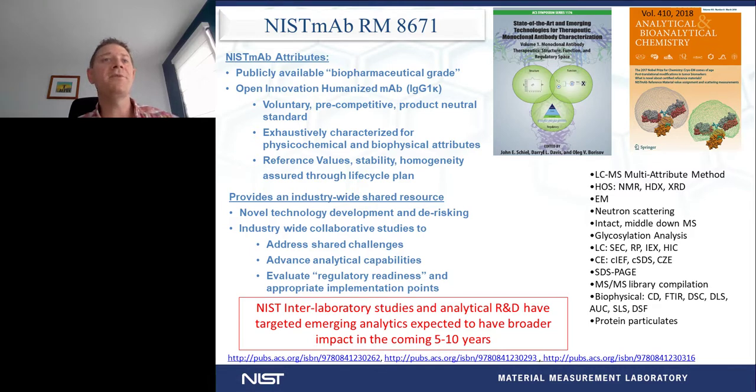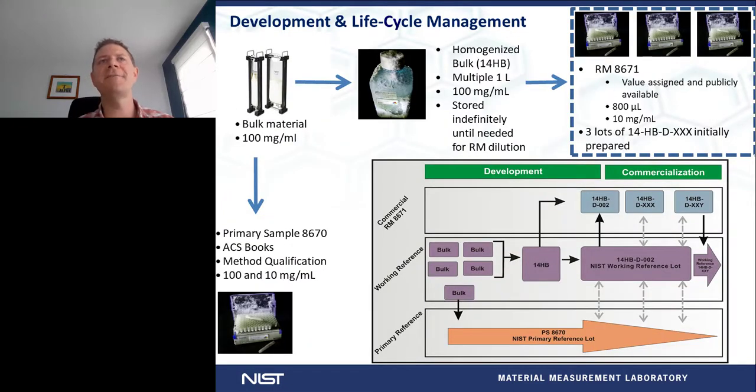And we think that this can be used really for a variety of collaborative studies to address shared challenges within the community, to assess current analytical capabilities and the state of the art, and again, evaluate the regulatory readiness of new and emerging analytical techniques. So we've been focused since release of this material in 2016, over the past few years, on ramping up our analytical efforts to develop innovative technology and also perform interlaboratory studies to evaluate the current state of characterization of some of these new techniques.